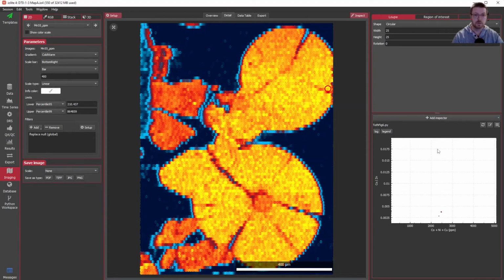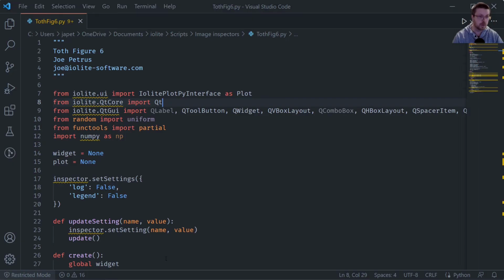Okay, so now as we mouse over this, you can see that the plot is changing and we have our other regions, but actually it's not plotting our big red spot like we said it was. So let's have a look at that problem.